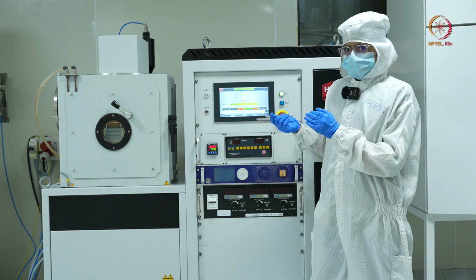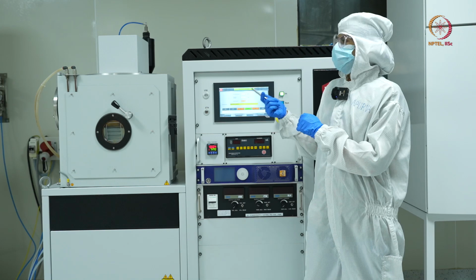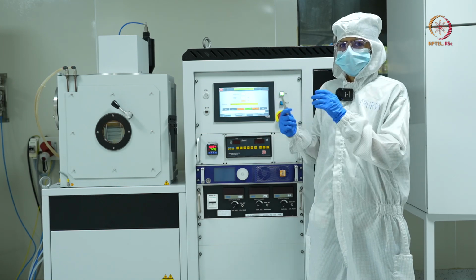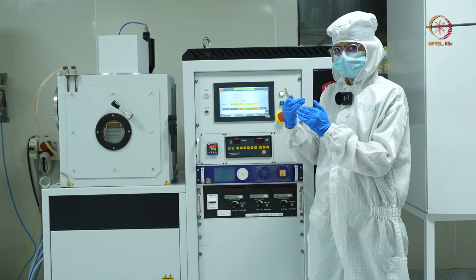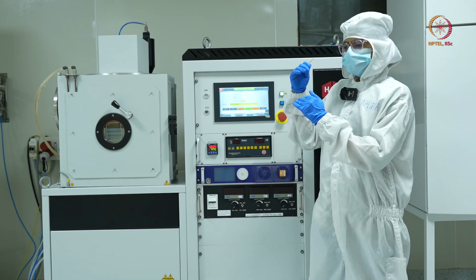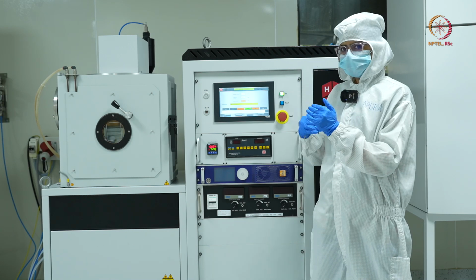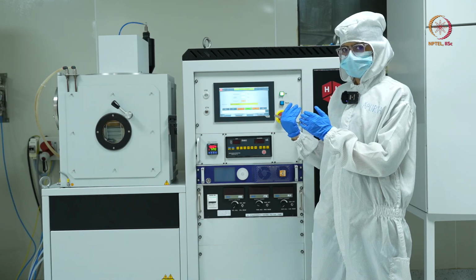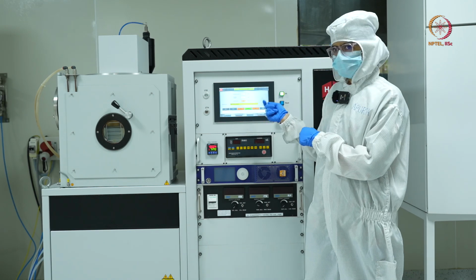Why? Because for this deposition we will be using argon gas. That argon gas will come in, get excited and move out, so there should be some gap through which this argon gas can go out of the chamber. That's why the system has gone into throttle pumping mode.